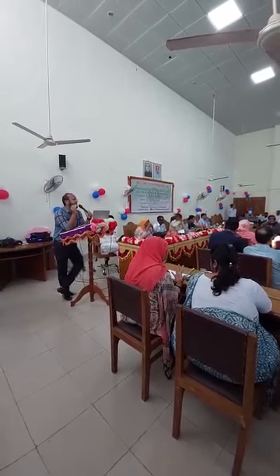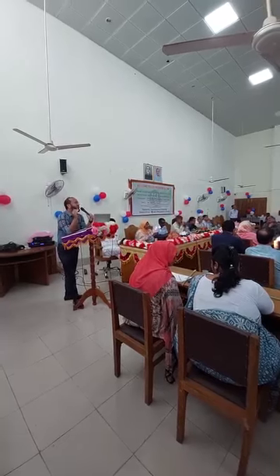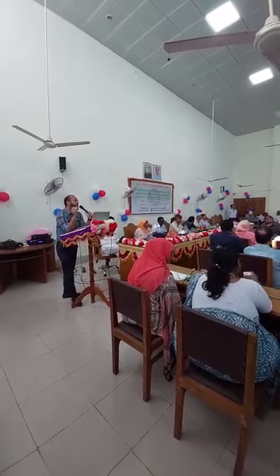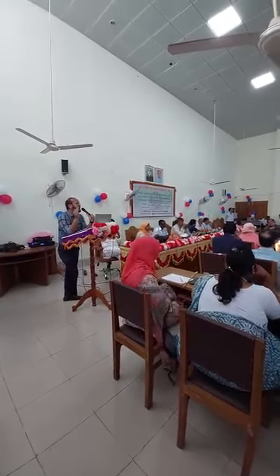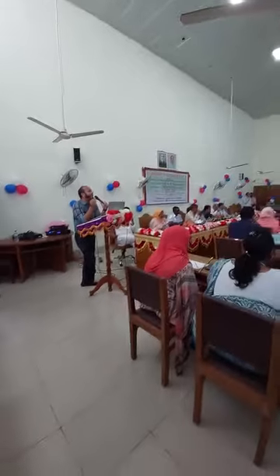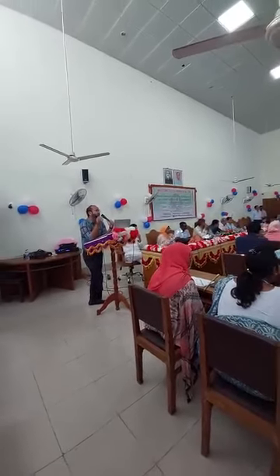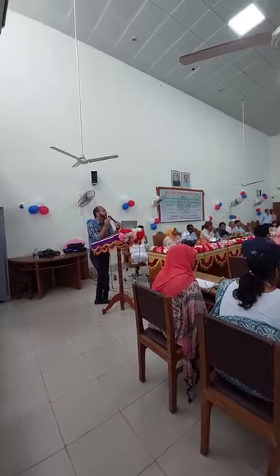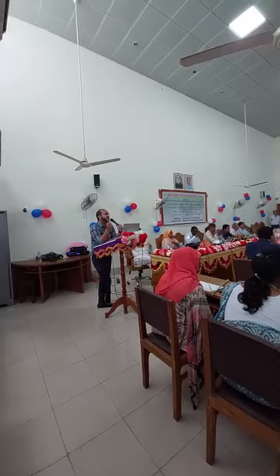Here I should mention that the cytopathology or FNAC sample should be fixed with 95% ethyl alcohol. Why? Because if we do not fix the cytopathology sample with alcohol, the individual cell morphology will be lost, and as soon as possible the FNAC material should be fixed with alcohol.